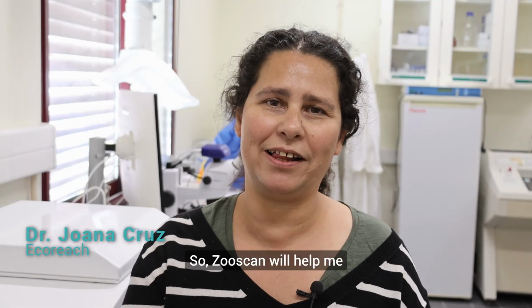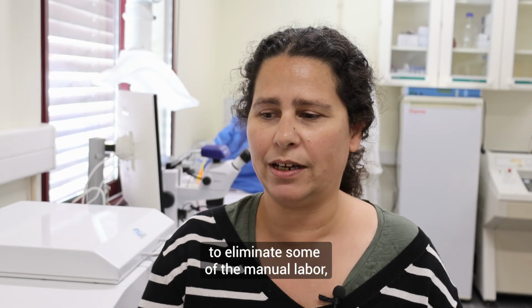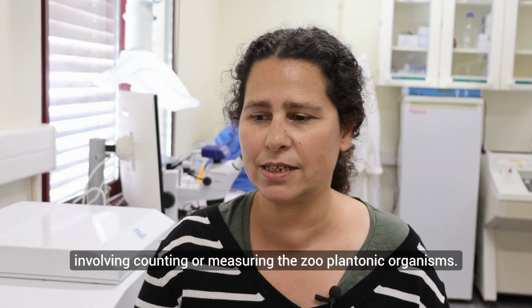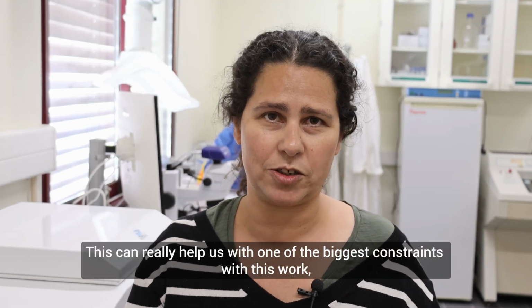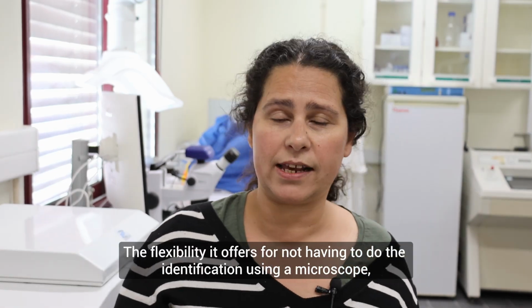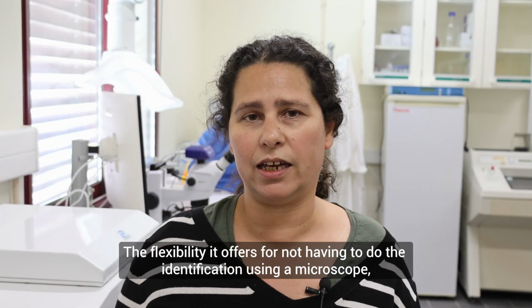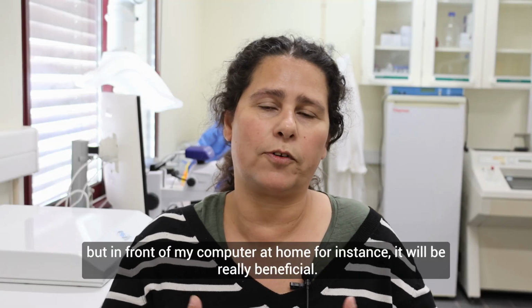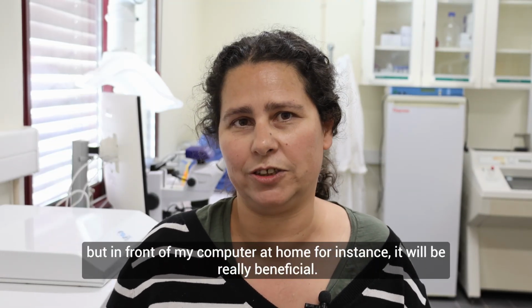So ZooSCAN will help me to eliminate some of the manual labor involving counting or measuring the zooplanktonic organisms. This can really help us with one of the biggest constraints with this work, that is lack of time. The flexibility it offers for not having to do the identification using a microscope, but in front of my computer at home, for instance, it will be really beneficial.